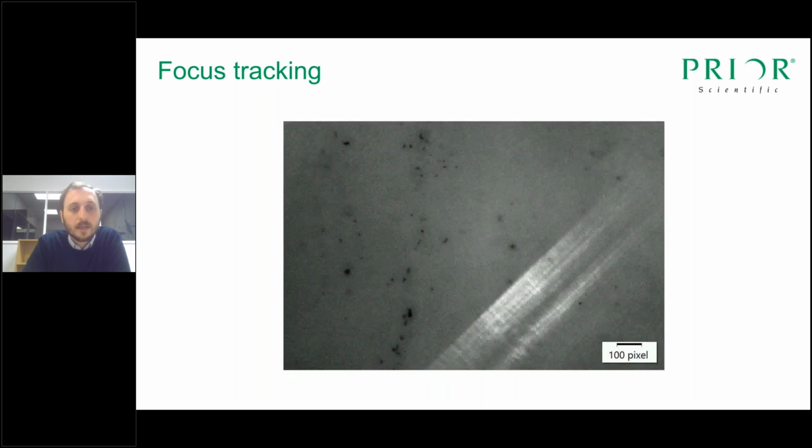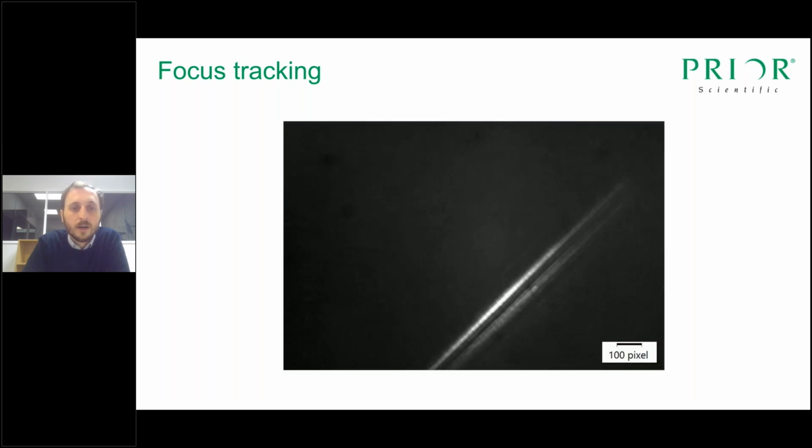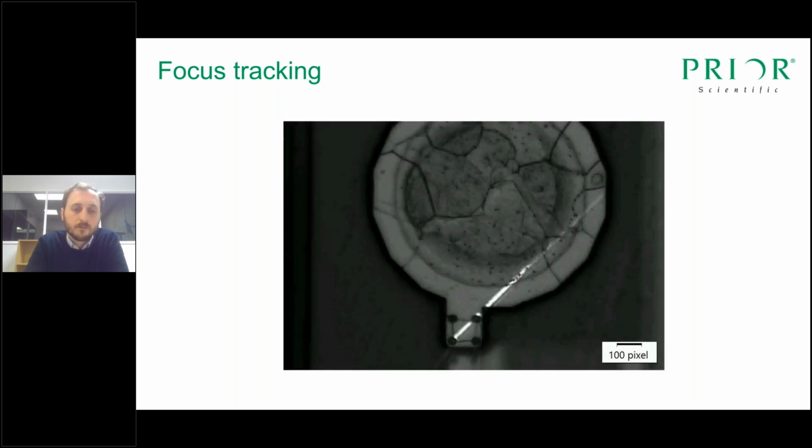If we just move on to the beginning, now with the servo activated, we can move across the majority of the diameter of this 4-inch wafer without losing focus at all. There we are. So you can see the difference that an autofocus can make there. It can make operating a microscope that much easier when using these very large samples at high magnification.